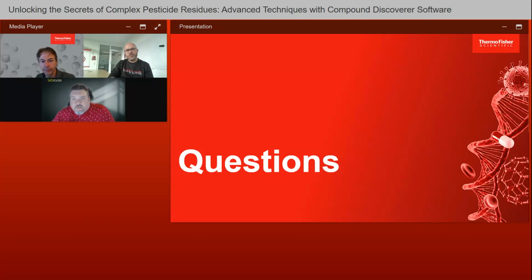All right. Another one here for you. Do you need to use mzCloud for the source fragment search?